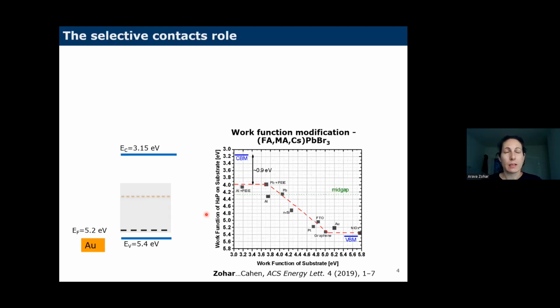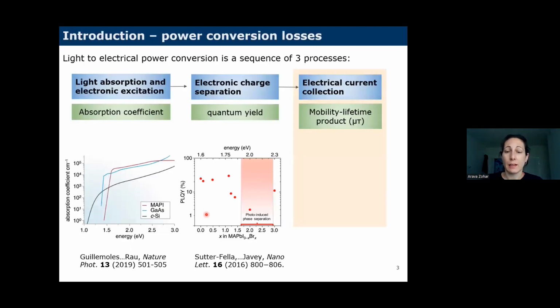This phenomenon can be explained when the depletion layer of the layer itself is not wide enough to see the carriers of the perovskite. In simple words, the perovskite layer was transparent in terms of the work function; we measured the substrate itself. This was published in a different work, but why do I tell you this?